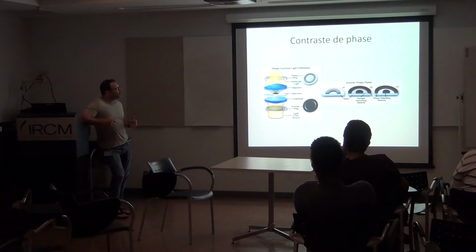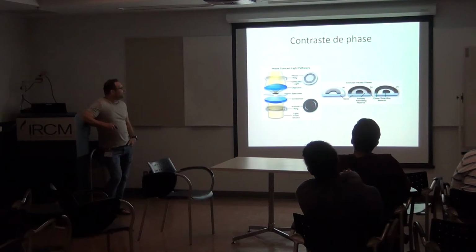And so when you use phase contrast, usually you put a green filter in order to only use the light from the green component. Okay? So if you really make the real phase contrast, you would use a green filter, and you would use that ring, and you would use an objective which has a conjugate ring grooved into its lens.